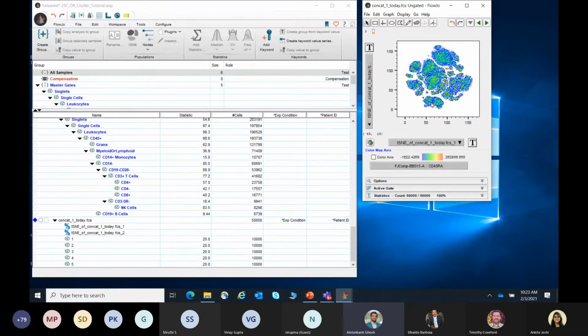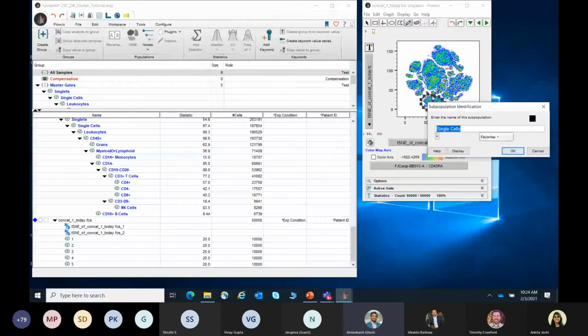So for that, what you have to do is select any one of the gating tools that you can use. I would use this pencil, which is quite a smooth one. So you can just select any area which you want to see details of. You can just encircle it, and for me I'll just put the name as query.